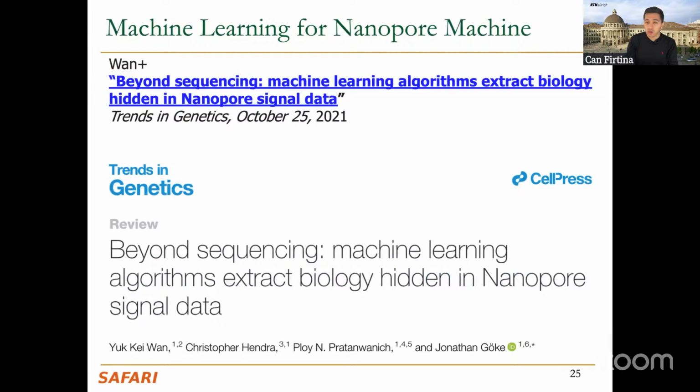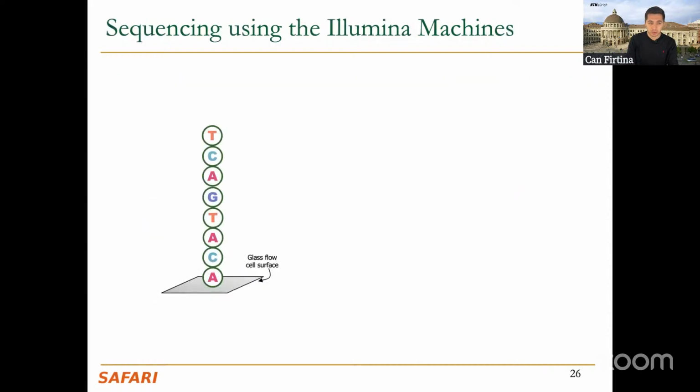So also, as I said, Nanopore raw signal data retains richer information than just individual bases. If you're interested in what we can do with this type of information, you can take a look at this paper. So now we're done with Nanopore sequencing.